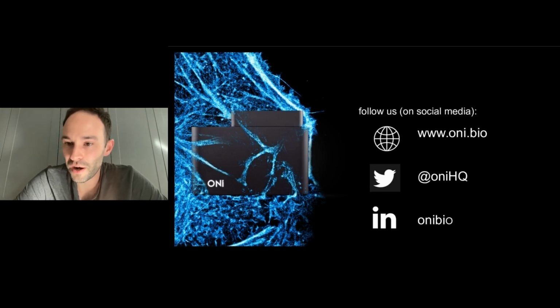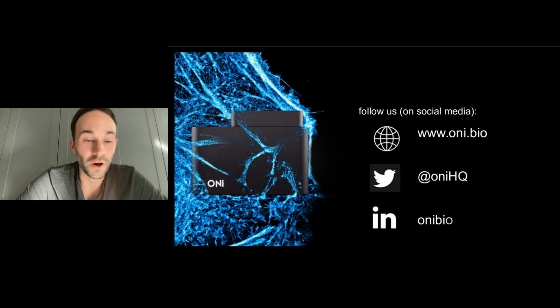And then there's a question here about does the nanoimager require an anti-vibration table? No, it doesn't. So it's very stable in and of itself. You can put it wherever you want.